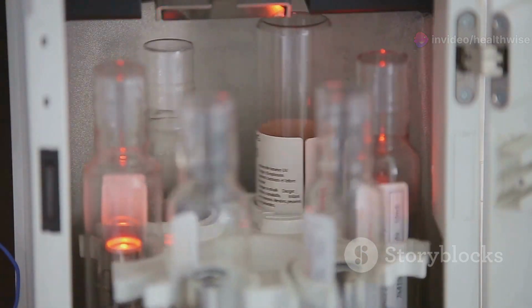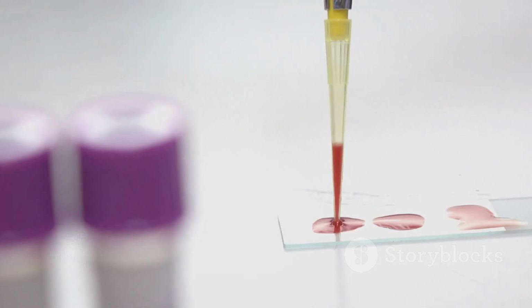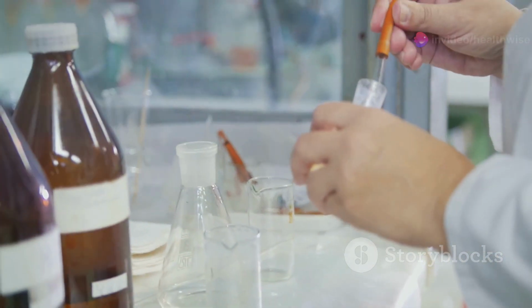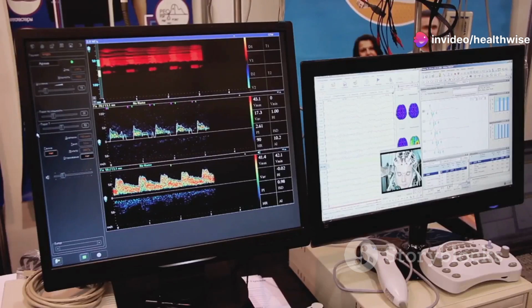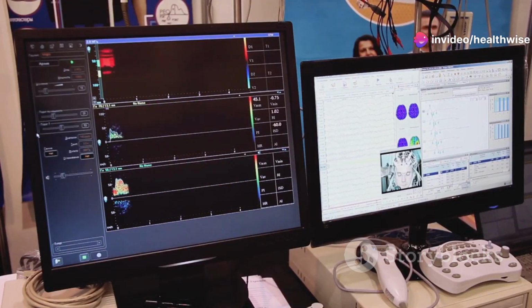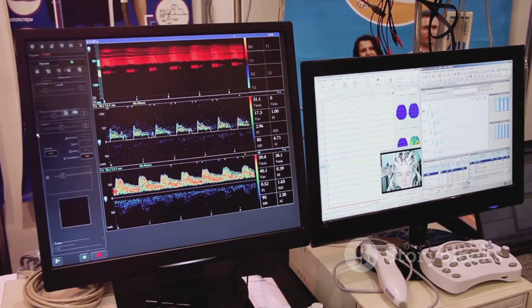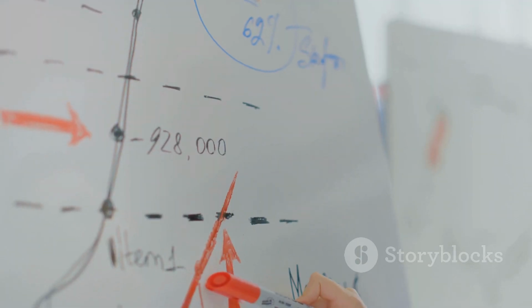Let's move on to the procedure. Set up 5 test tubes in a rack and proceed as shown in table 5.3. Process the entire batch according to your method sheet. Take the absorbance readings up to 3 decimal points and plot each absorbance reading against its corresponding concentration on linear graph paper. Join all the points on the graph.